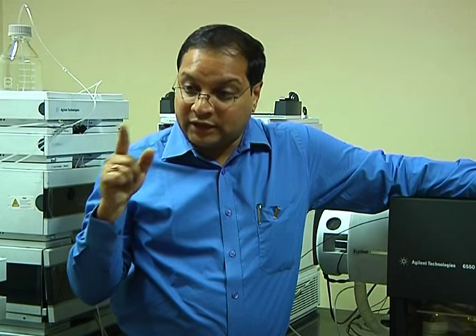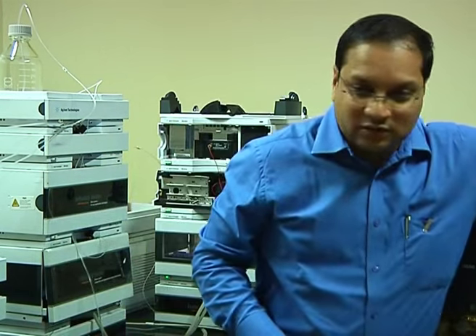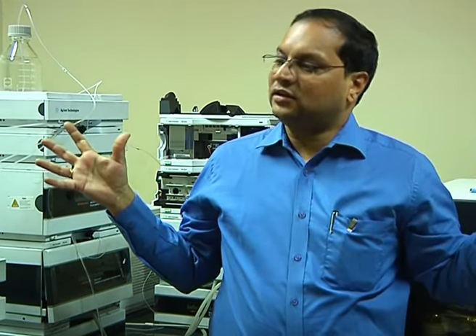Of course, it cannot be as sensitive as a triple quadrupole, because the third analyzer is scanning. It is not a mass filter like in a triple quadrupole. Since it is scanning, it is wasting time scanning something which is not relevant, and hence you may lose something. That's why it is less sensitive than a triple quadrupole.